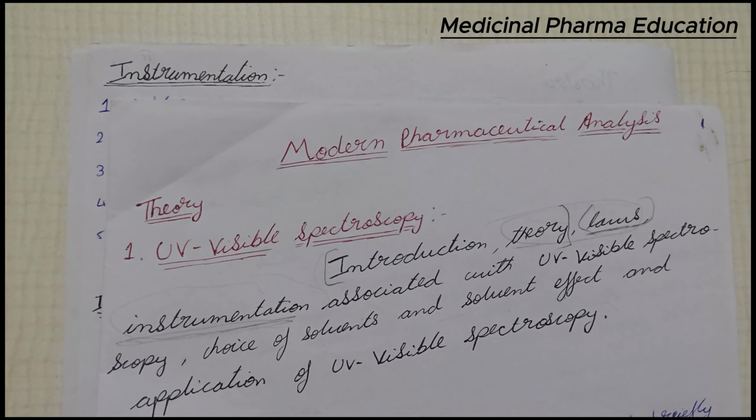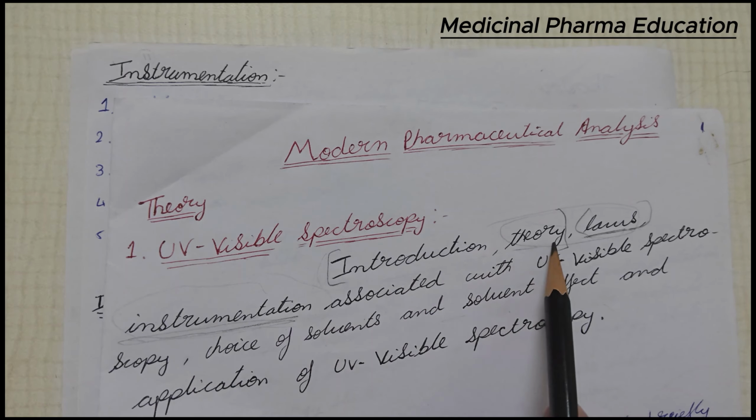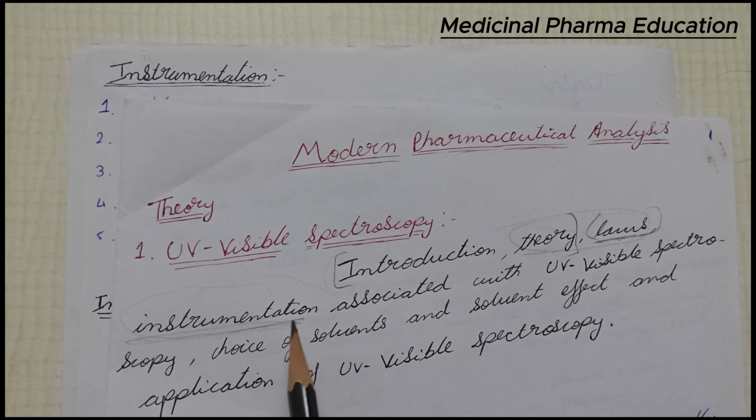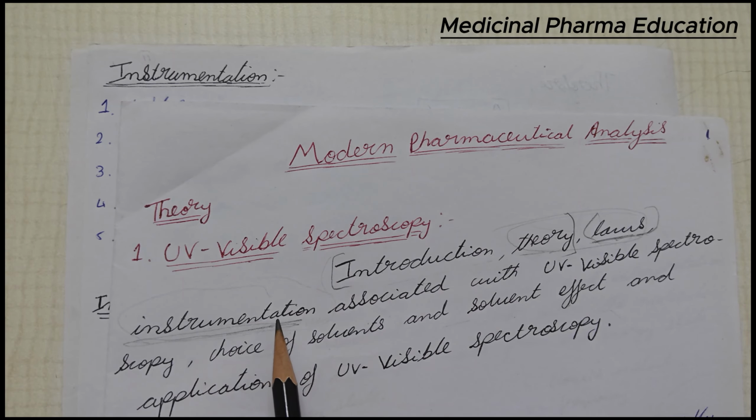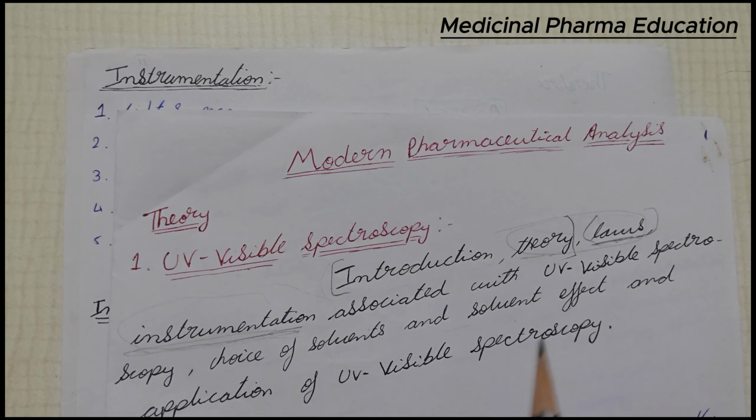Today we are going to start with the instrumentation. In the previous video we studied the introduction, theory and Beer-Lambert's law. In today's topic we are going to complete the full instrumentation of UV-visible spectroscopy.